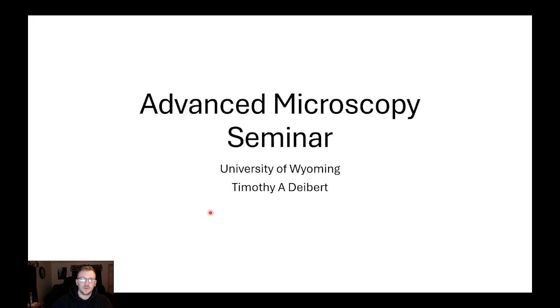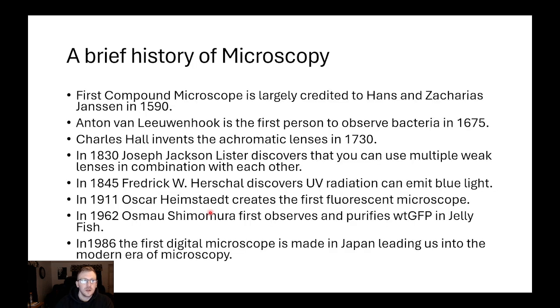Hello and welcome to what is going to be a series of videos over the use of advanced microscopy and some of the applications and techniques and kind of the fundamentals needed to be able to conduct research using a microscopy approach. So I want to start with just a brief history of microscopy.